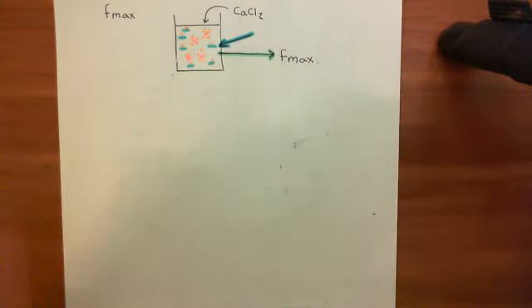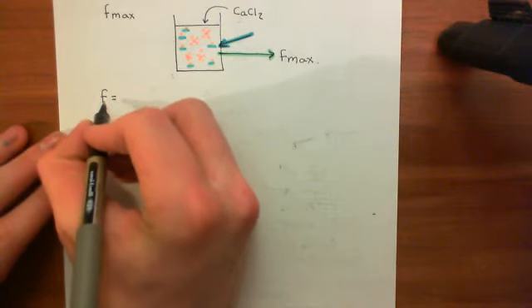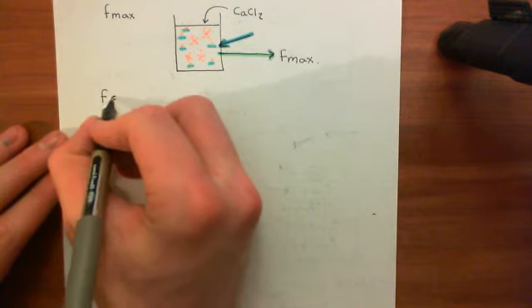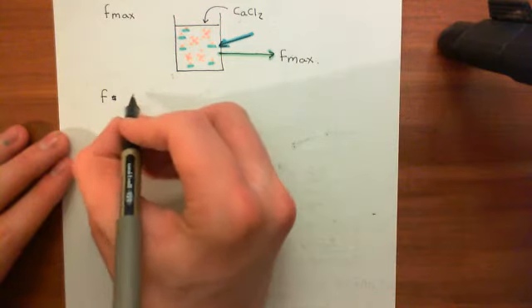Okay, right, so we've now got all of the pieces of information we need. F, which was, remember, the intensity of the green light that we were getting out when we just added the Fluo-4 to our original calcium test solution, okay, so we hadn't added BAPTA or anything else like that.